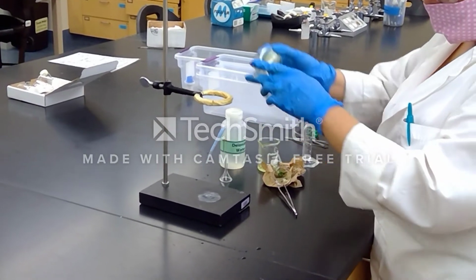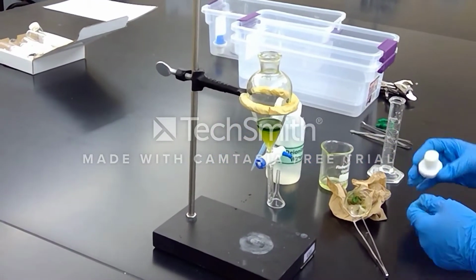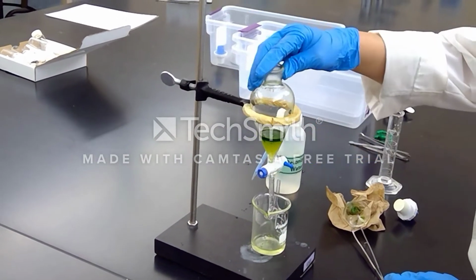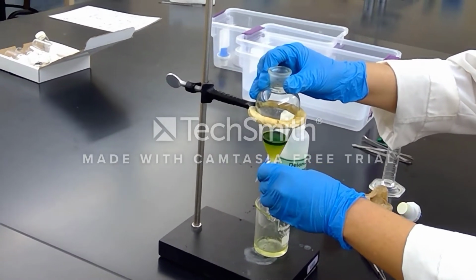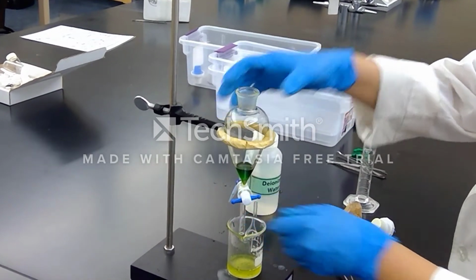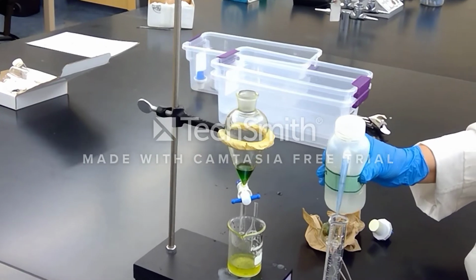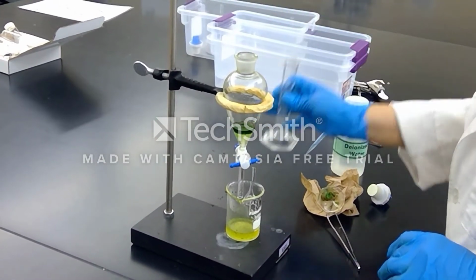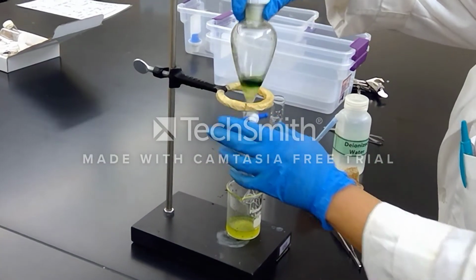Okay. And now I'm going to go ahead and separate that lower layer. Because we're interested in the hexanes layer, which is up above, I'm going to go ahead and release the lower aqueous layer, which we will not be using for the extraction. Okay, I'm going to repeat the extraction with another 5 milliliter portion of water here. This is to ensure all of the aqueous compounds are out of the extraction.